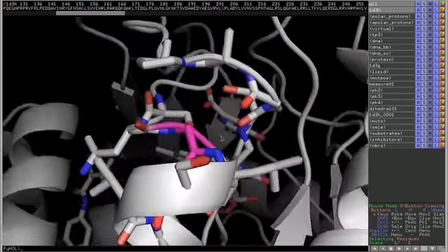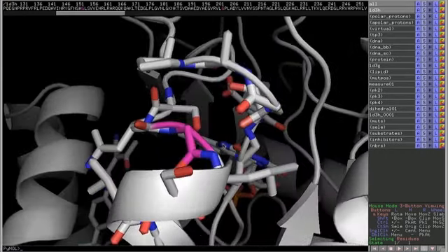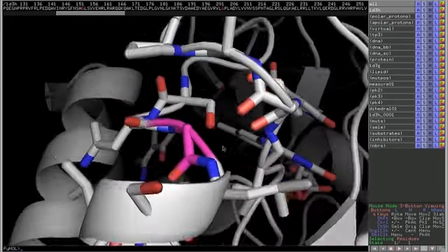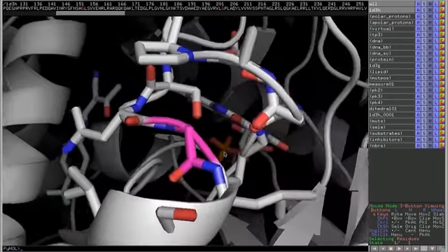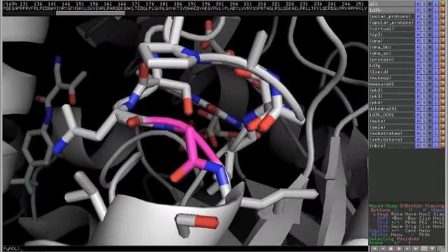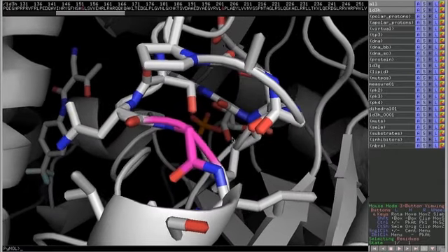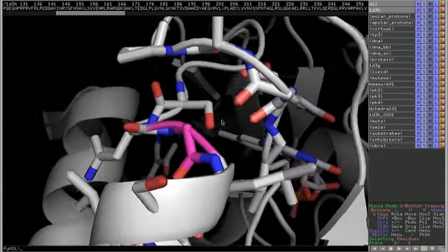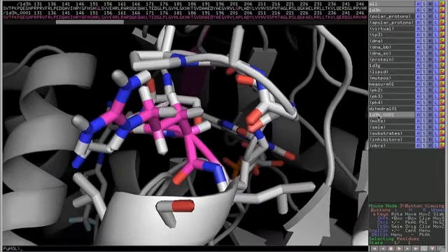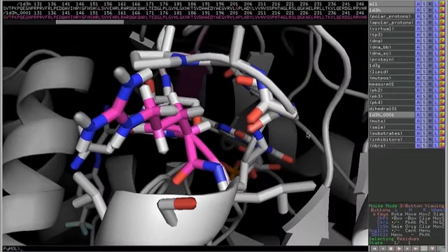And what's really striking to me as a structural biologist is that it's packed very tightly around that glycine. So there's not a lot of space for other stuff to fit there. In particular, if we were to mutate that glycine to an amino acid that was bigger, which would be pretty much any mutation, but in particular the mutation that we're interested in here, there's just not space to fit everything. For example, we went ahead and modeled in a mutation to an arginine, and now I've gone and shown that.